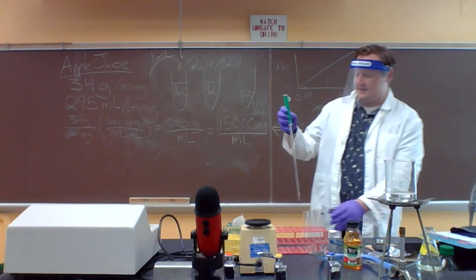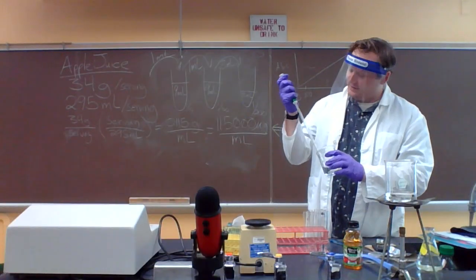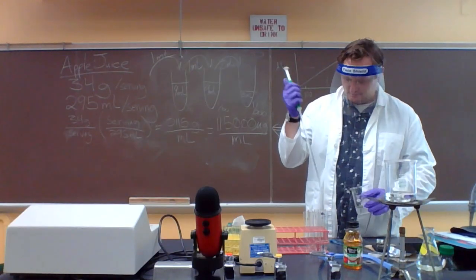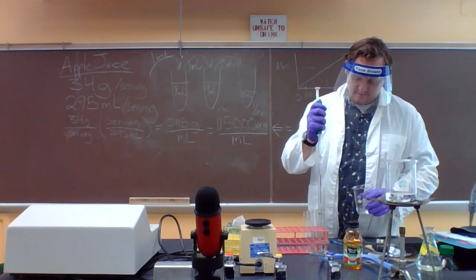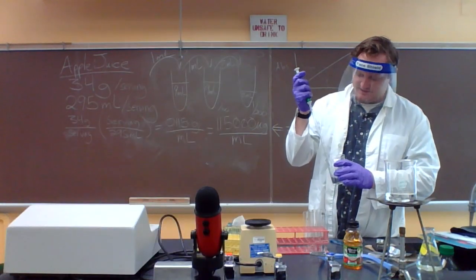We'll be adding 9 milliliters of water to tube 1. Nine milliliters to tube 2.